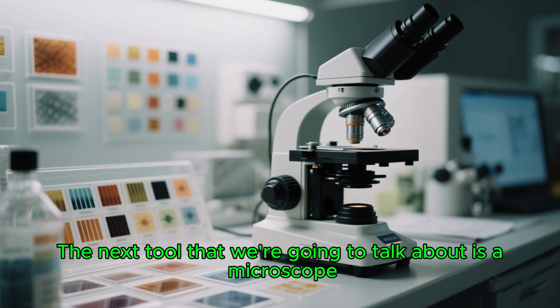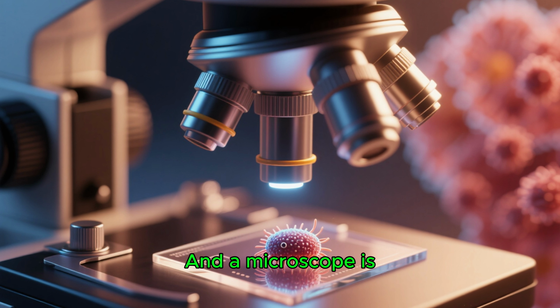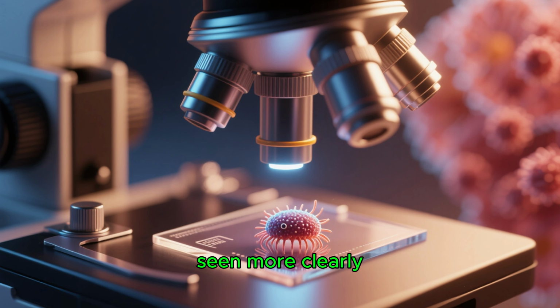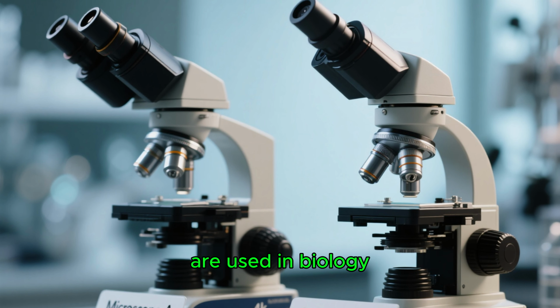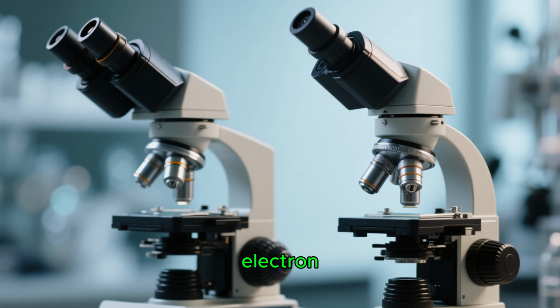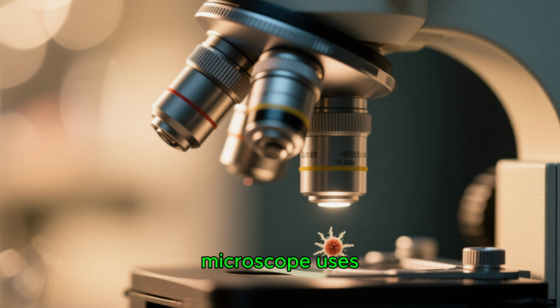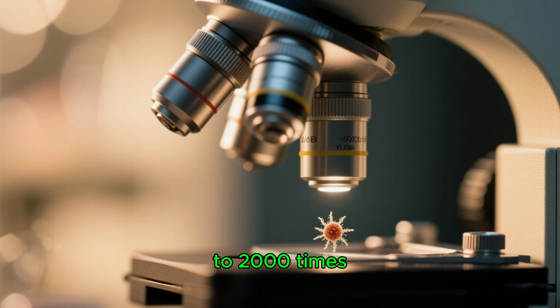The next tool that we're going to talk about is a microscope. And a microscope is used to magnify small objects so that they can be seen more clearly. Now, there are several different types of microscopes that are used in biology, but the two main ones are light microscopes and electron microscopes. Now, a light microscope uses light and lenses to magnify objects up to 2,000 times.